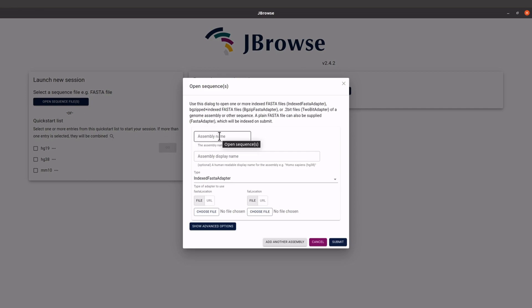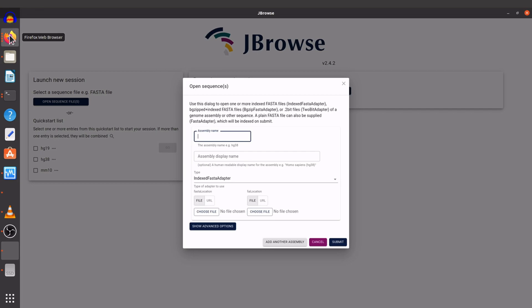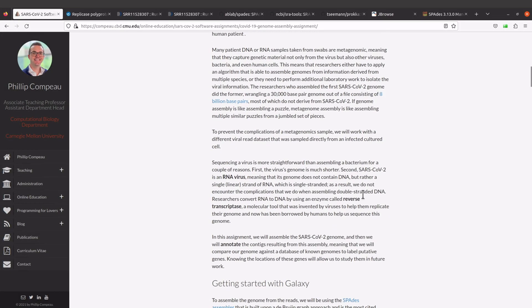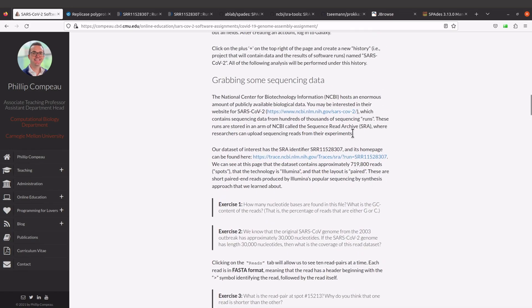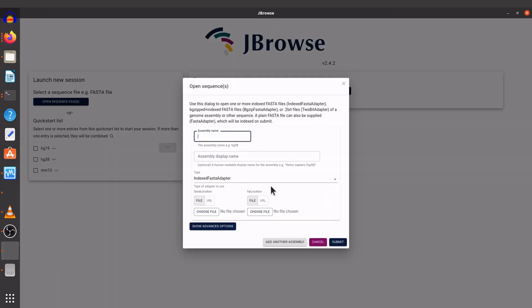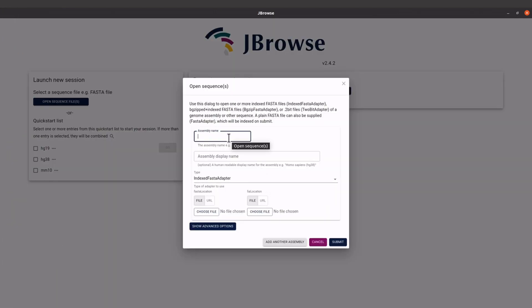You'll be given this window. Here you have to give an assembly name, so I will use the accession ID for our data — let me just check. Yeah, it's somewhere here, I'll just copy and paste that. You can give it any name that you want, that's also fine.